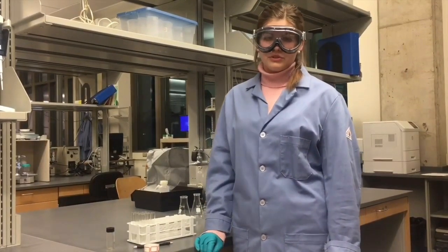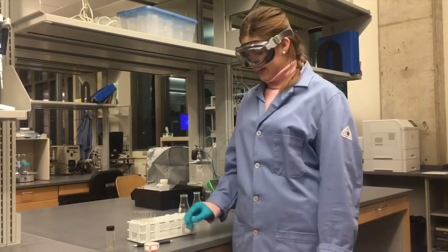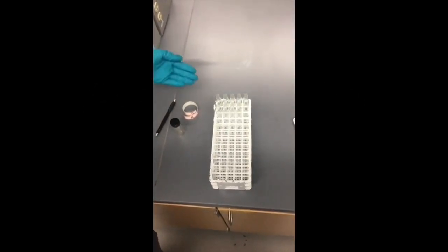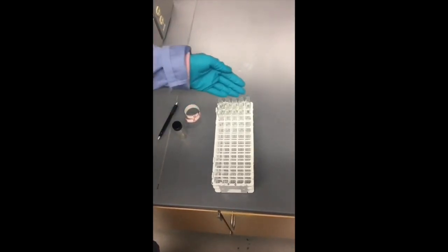All of these individual tubes need to be entered into the rack of tubes in a specific order. Make sure you plan ahead and label them well. The machine will read the rack just like you would read a book. It will draw from the top left corner and work to the right, before shifting back to the next row and reading across again.